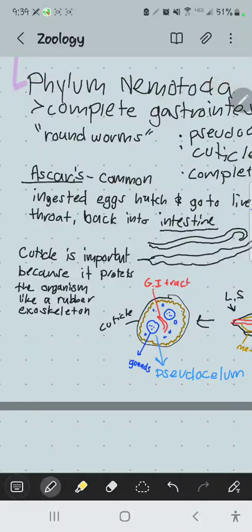Okay, so intestinal roundworms. This is basically a small intestine here full of roundworms on a section. And this is from the Center for Disease Control. You get it by ingesting eggs, and the parasite lives in your small intestine. Okay, hookworm. Actually, let's skip that one. We're going to go to this one first. The next one we're going to look at is Enterobius.